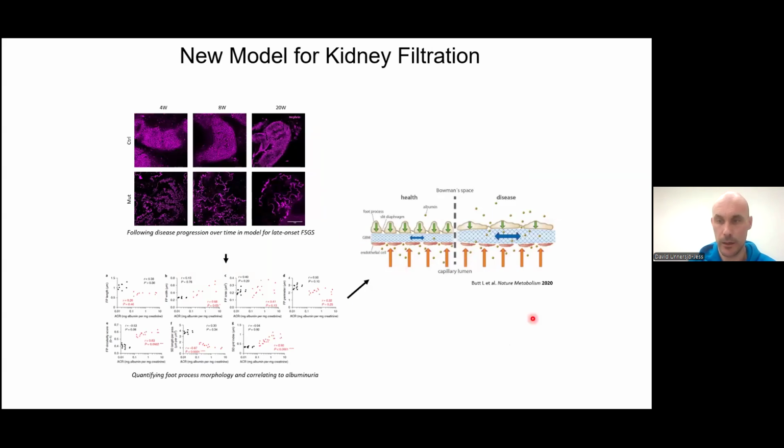Back in 2020, we published a paper which presented a new model for how kidney filtration works, and especially why kidney filtration fails in the disease state. I'm not going into detail here for the sake of time, but the input data for all of this was the STED imaging. So this really helped answer new questions in kidney physiology.